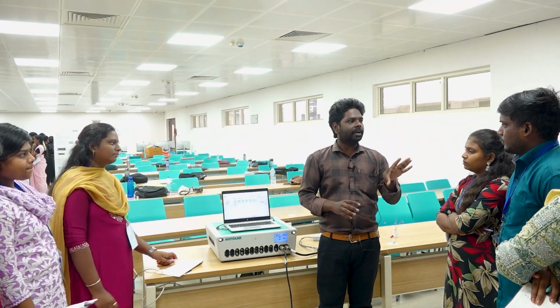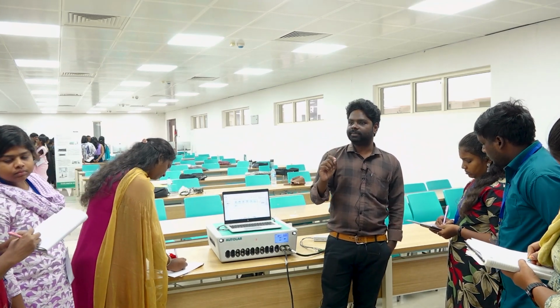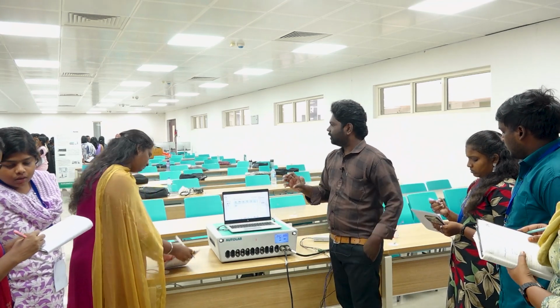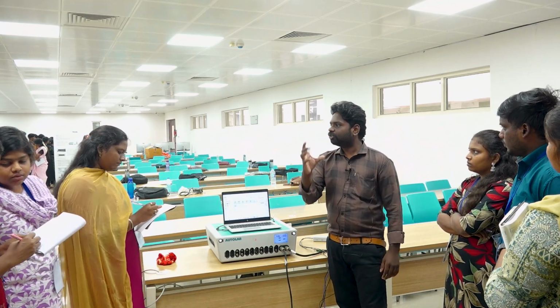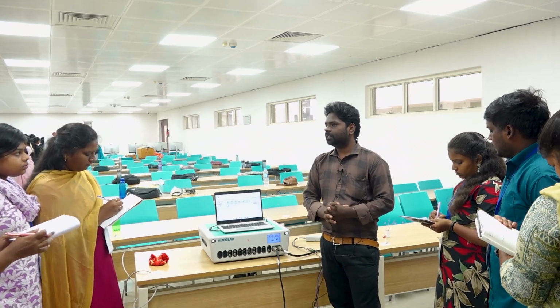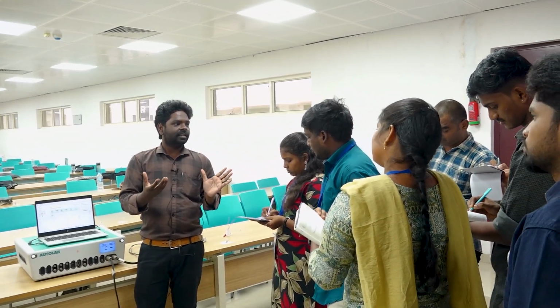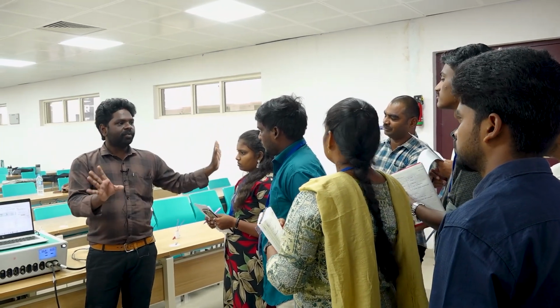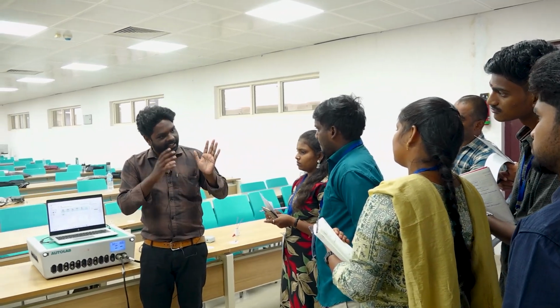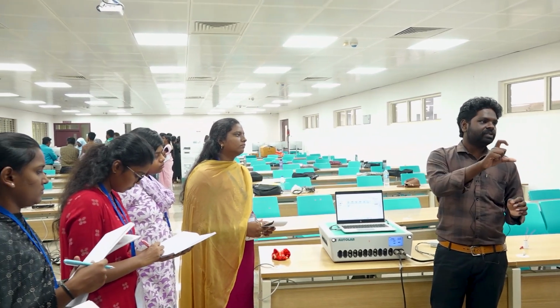So another one is Warburg. Warburg impedance, the name is W-A-R-B-U-R-G. Warburg is simply denoting the diffusion properties of our sample. So what is diffusion? Yes, sir, definitely ion moving is diffusion, right? But ions will always move if there is a difference. But what is diffusion?